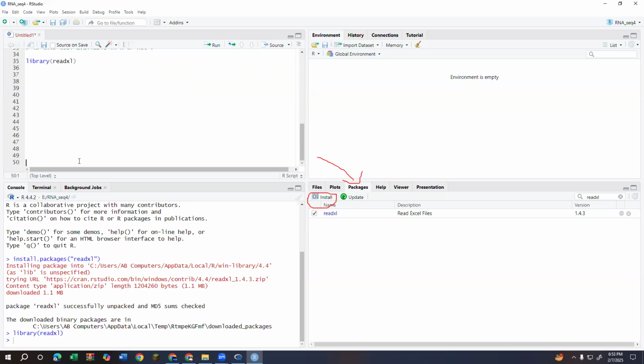Okay, some participants are very new to programming. So today we have learned some basic things. In our first three classes, we will learn some basic things: how to read, write, edit, and generate scripts.